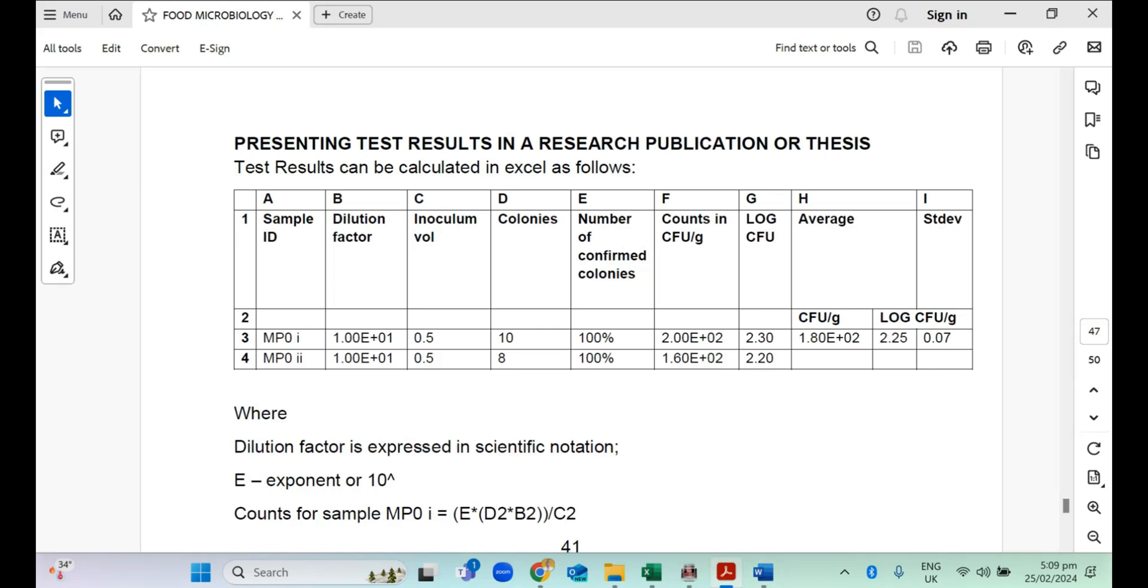You would find the log CFU of this. That is just converting this to the logarithm base 10 units, just to express it in numerical form. In terms of analyzing data for microbial analysis, we always use the logarithm units, the log CFU units and not the CFU per gram. Irrespective of the number of data you have, you express all of them as log CFU and it makes it easier to understand the data.